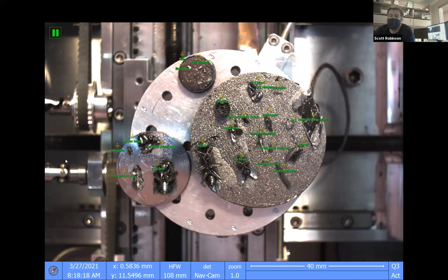Sometimes people want to put other things in the microscope for Bugscope. We have people who have done forensics and things like that, so they want to look at different kinds of weaves of cotton or something like that. And so sometimes people do things that aren't exactly associated with bugs, but I hope that's a good starting answer.